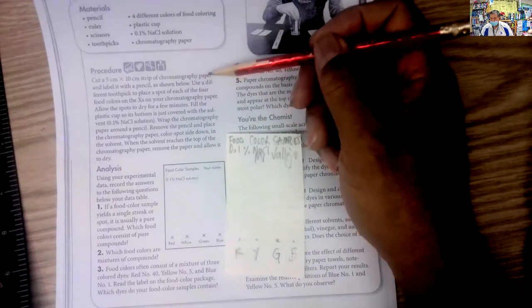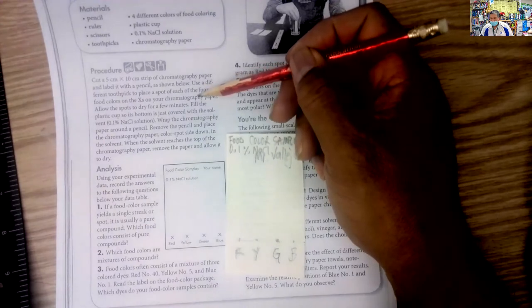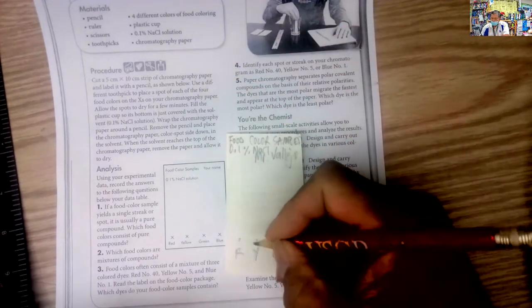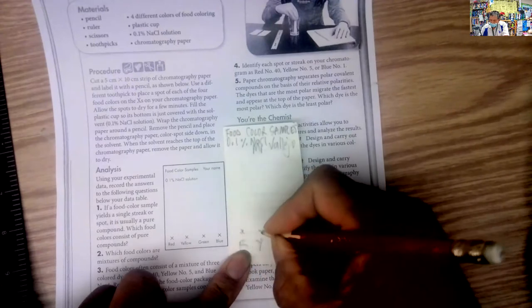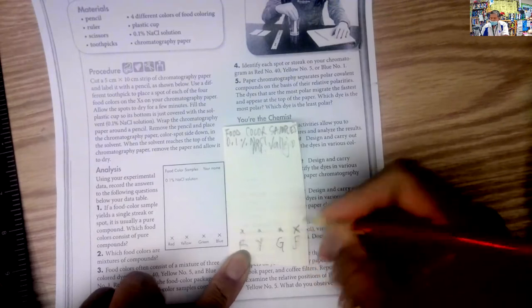Now the instructions say, use a different toothpick to place a spot of each of the 4 food colors on the X on your chromatography paper. Oh, they wanted an X, not a dot. That's fine. I'll make it an X. And now I have an X instead of a dot.